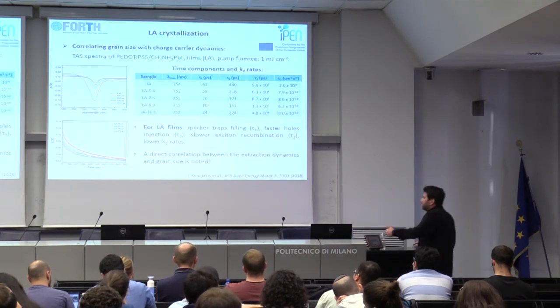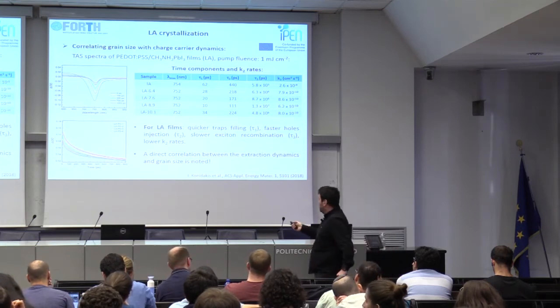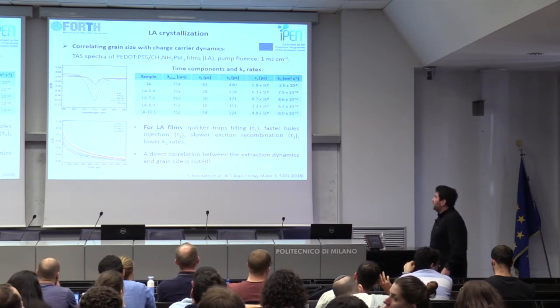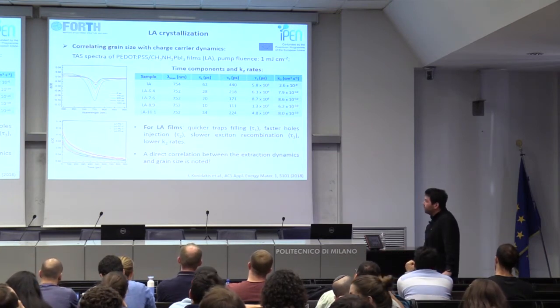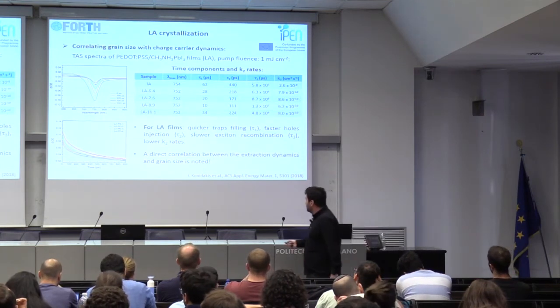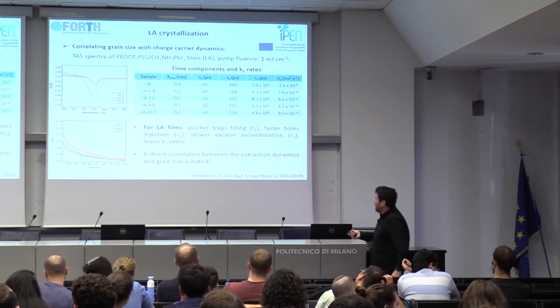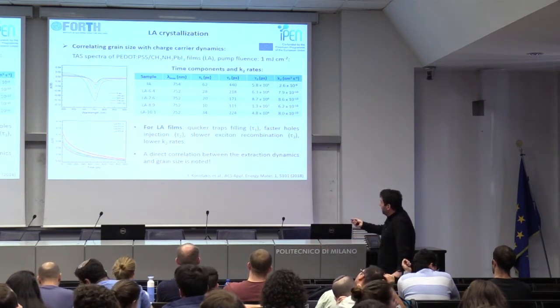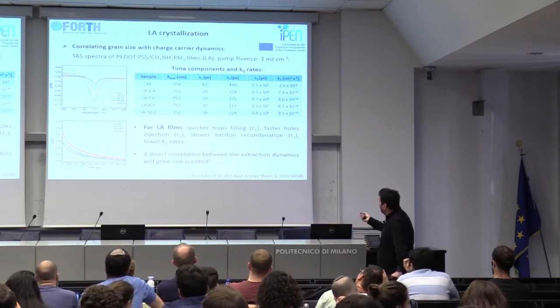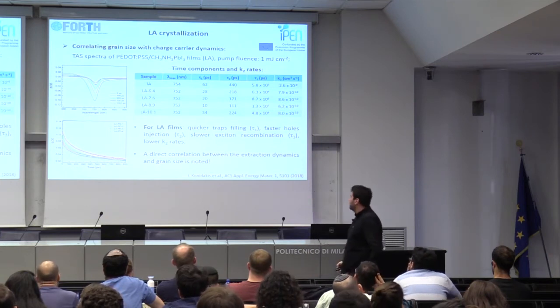So immediately we would like to check how the introduction of this new protocol affects the charge carrier dynamics and the recombination rates within this set of films. So this is a busy slide, but then again we perform TA analysis of all the laser-assisted samples that we made at different fluences, and we compare that with a reference sample which is created by thermal annealing.